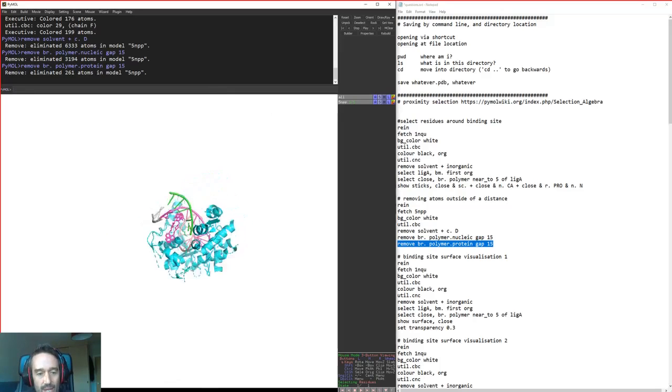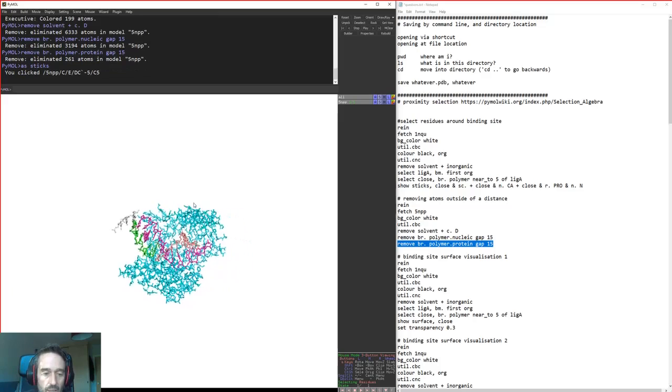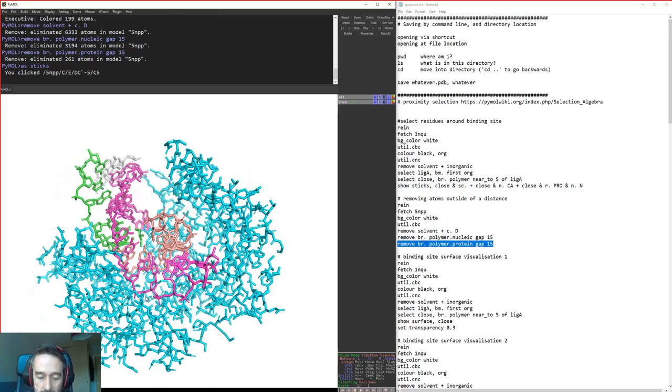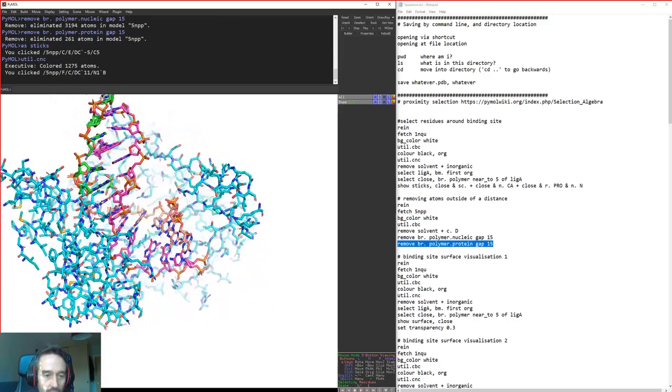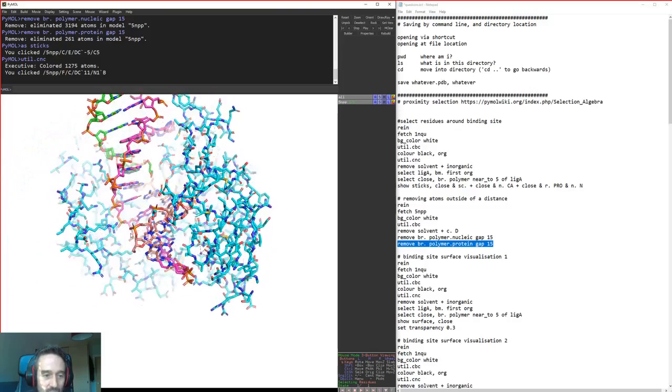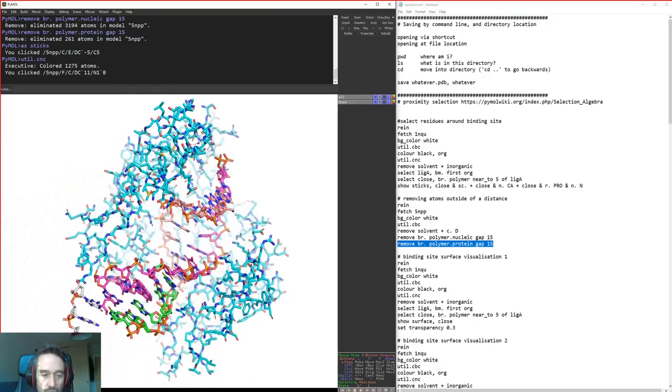And that means that now we have this more discrete collection of atoms here, which just saves on complexity. It can reduce the amount of burden or strain on your brain when you're trying to look at these interactions.